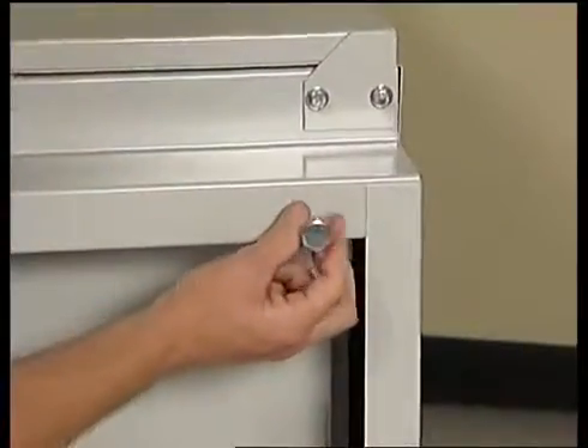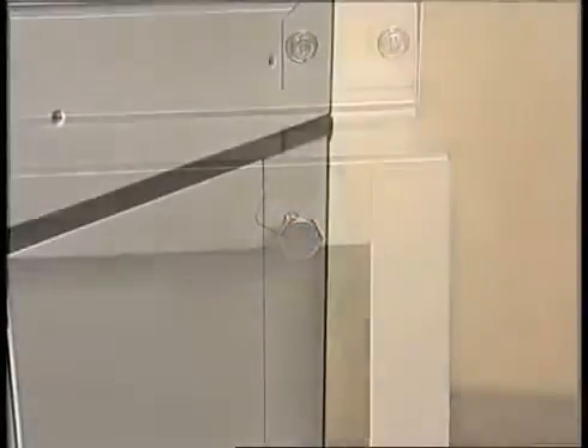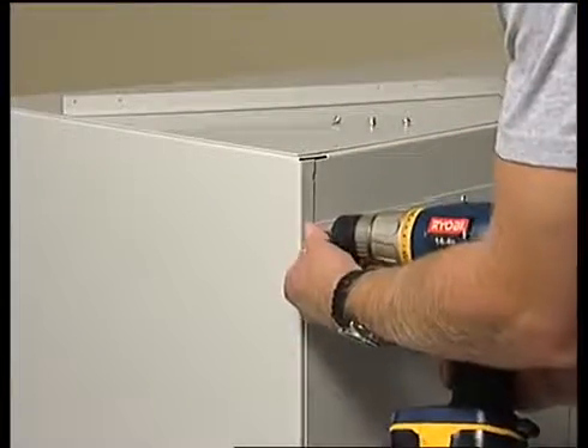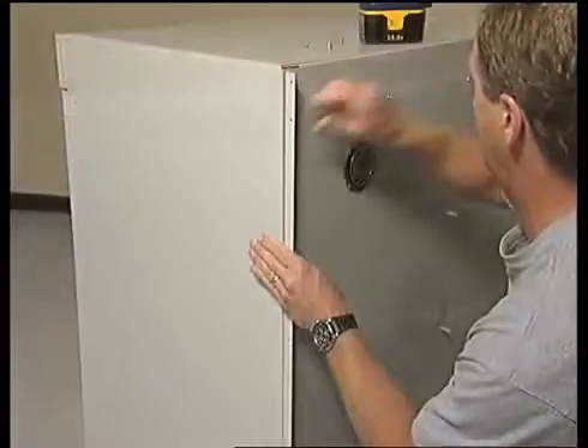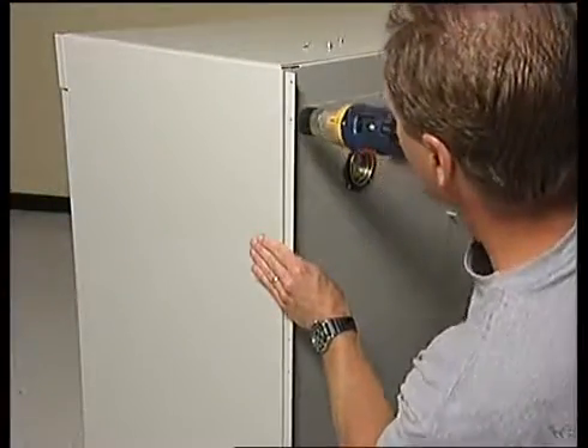Place the cabinet on its back to install a leveling foot at each corner. One filler panel and panel angle are included with the solvent storage cabinet. The filler panel gives you the ability to close off the 8-inch chase between the cabinet and the wall while allowing access to any utilities such as plumbing, electrical, and cabinet venting. Remove the four screws from the rear corner of the cabinet, then attach the panel angle directly to the back wall of the cabinet using the same four screws.